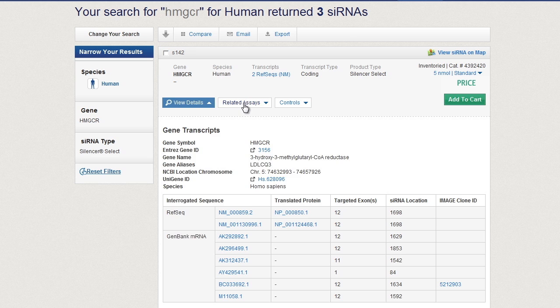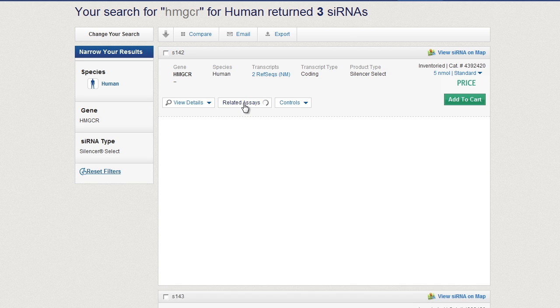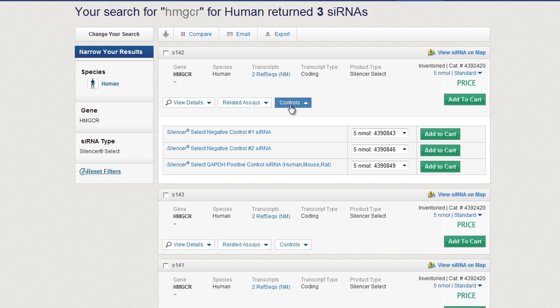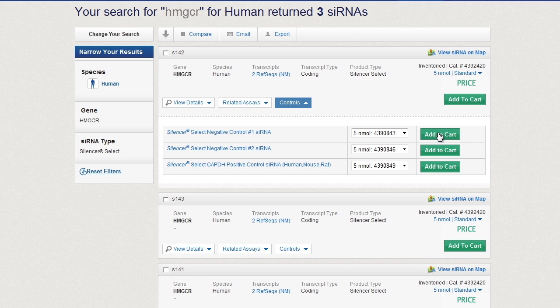Information on related TaqMan gene expression assays is just a click away, as is a TaqMan siRNA assay. siRNA controls can be selected and easily added. Once you've found the right siRNA, add it to your cart for checkout.